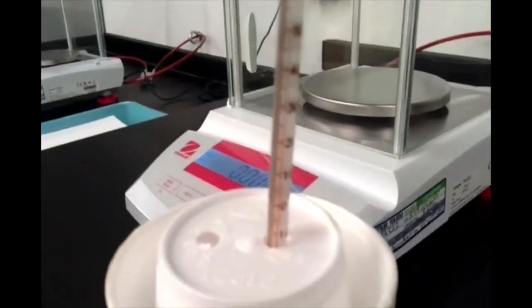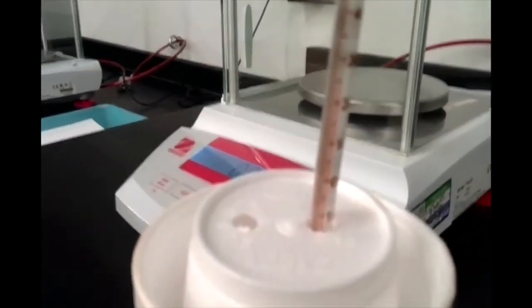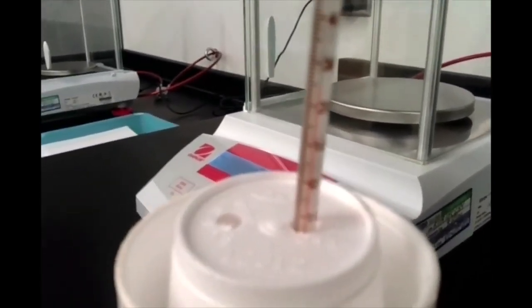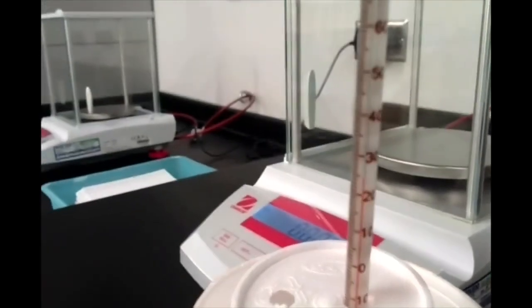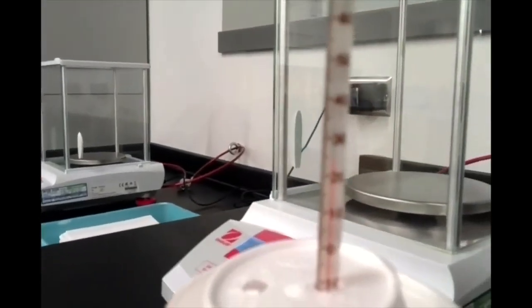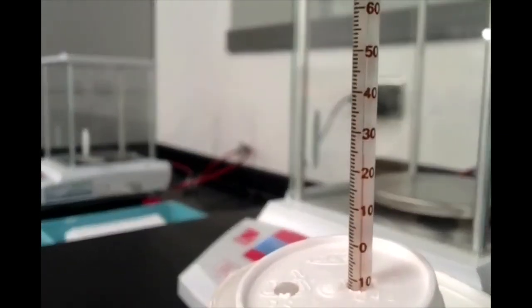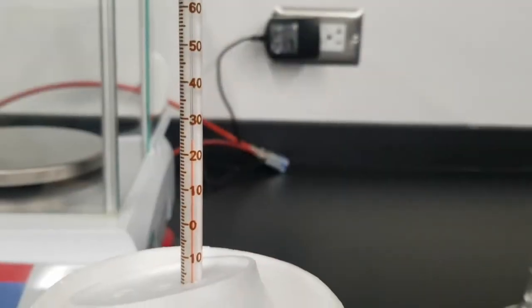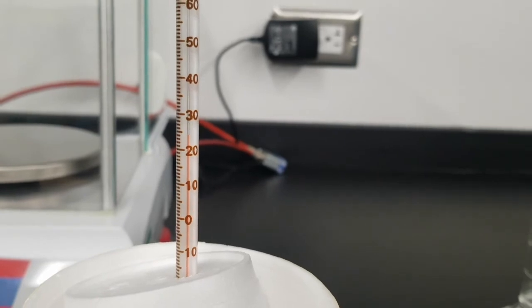So let's have a look at our temperature. See if that comes into focus. There we go. Let's try and avoid a parallax error on that. Here's a close-up of the temperature reading on our thermometer, so please make a note of that.